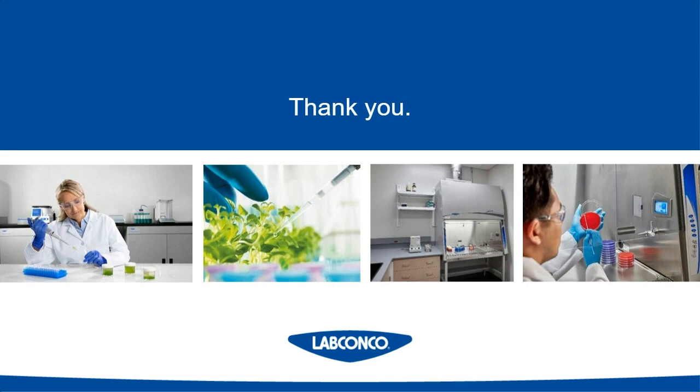You're really defined by the size of the cabinet as far as what equipment you can place in it. There are larger Class II enclosures that are available. They're not classified by A, B, or C, but most of them work similar to what you would find in a Class II A2 in that they can be exhausted or recirculate to the lab.